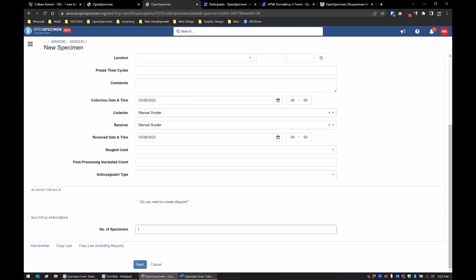So I would recommend getting whatever you can out of the application from screenshots and things like that. That way you have the data the way it looks in tissue metrics versus looking at it as a spreadsheet in a database. But yeah, everything's going down Thursday at 5.